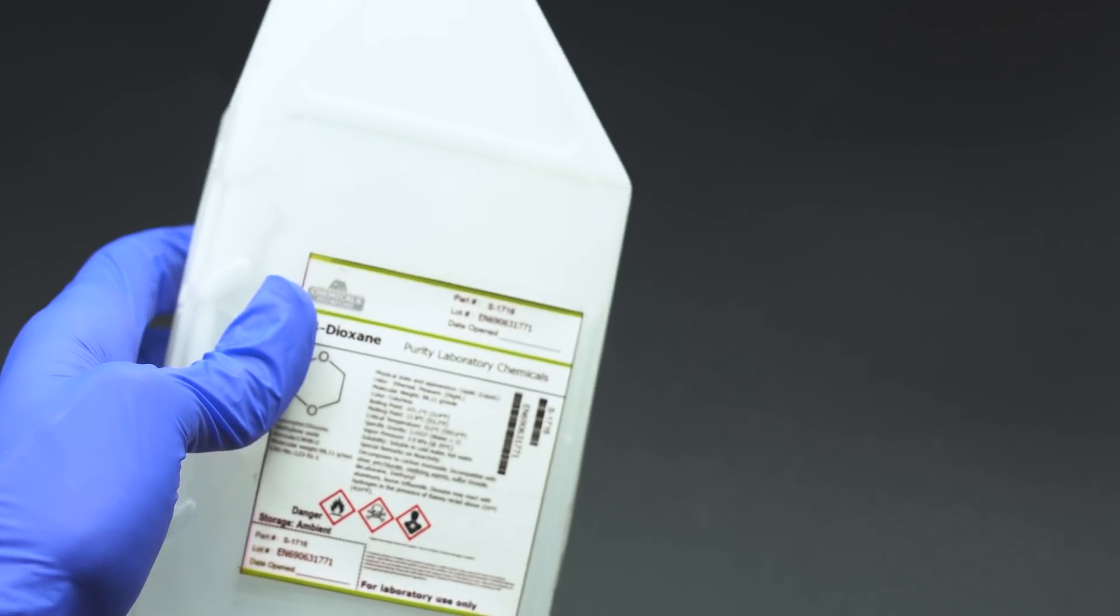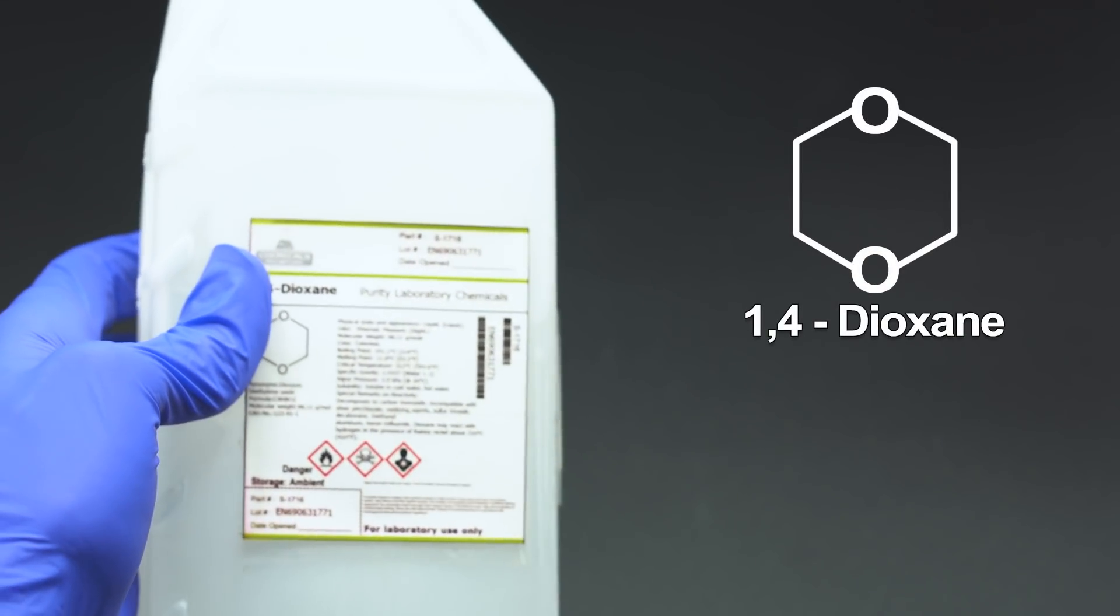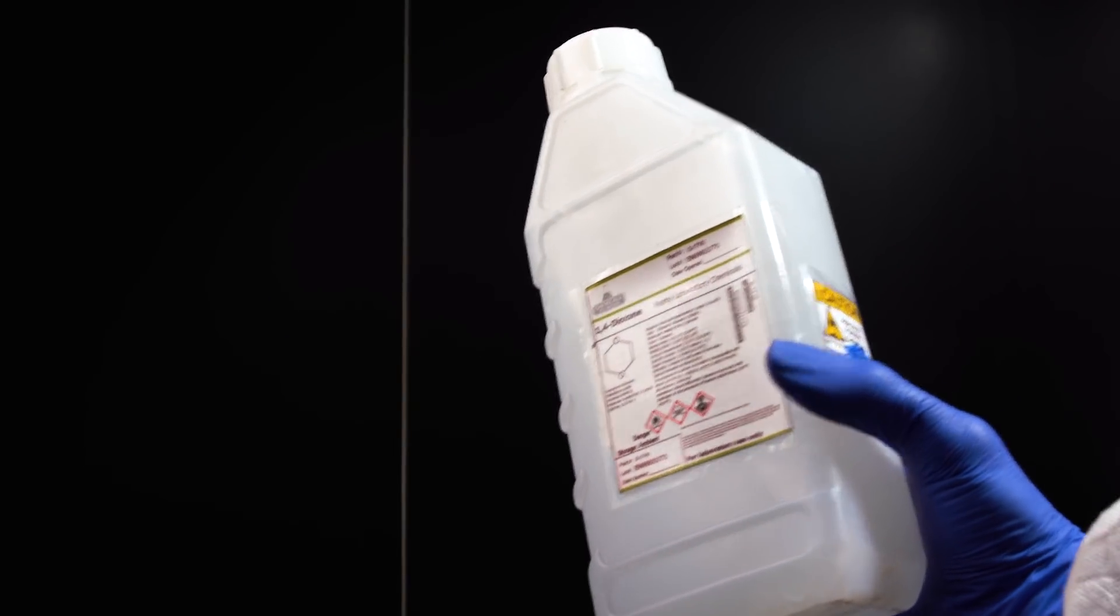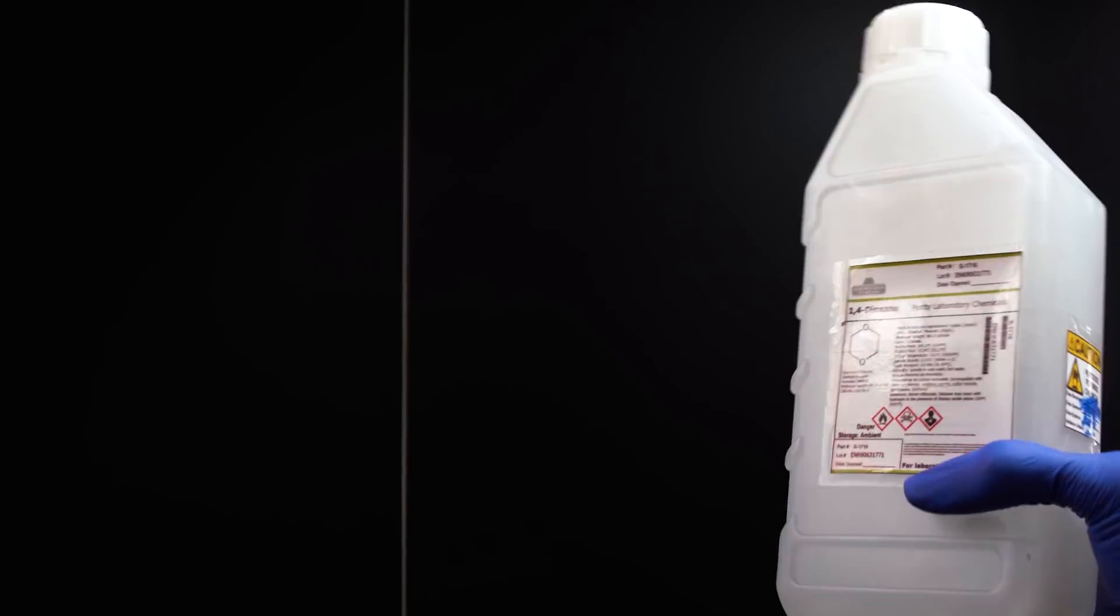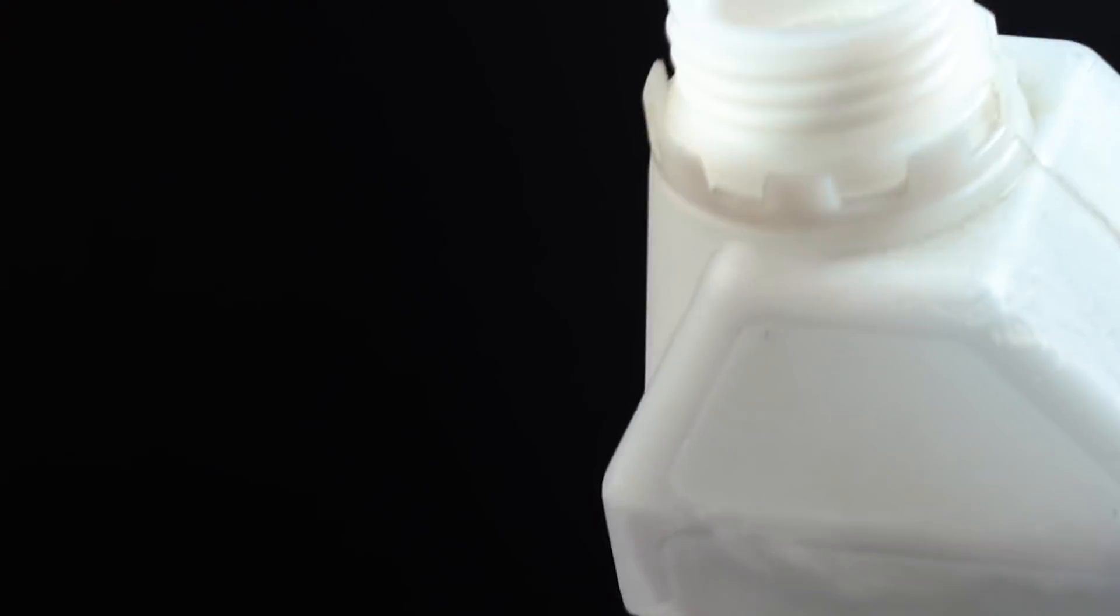So our first component is dioxane. It's a cyclic ether that is widely used as a solvent in laboratory practice. Dioxane is usually stored at room temperature because it starts to freeze up at temperatures below 12 degrees Celsius, which makes it difficult to use afterwards.